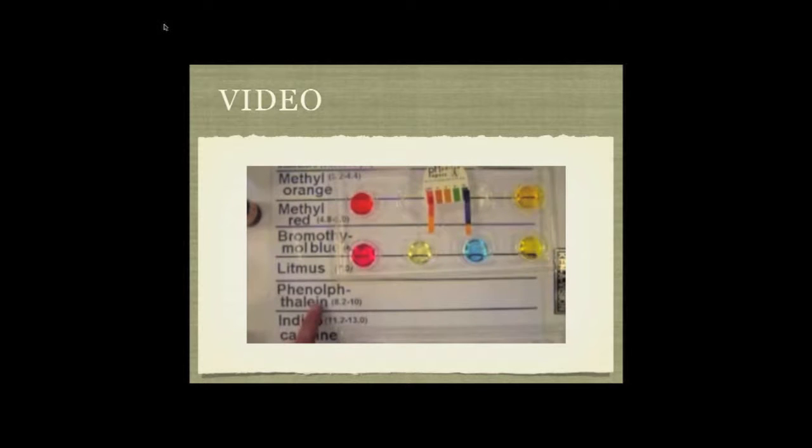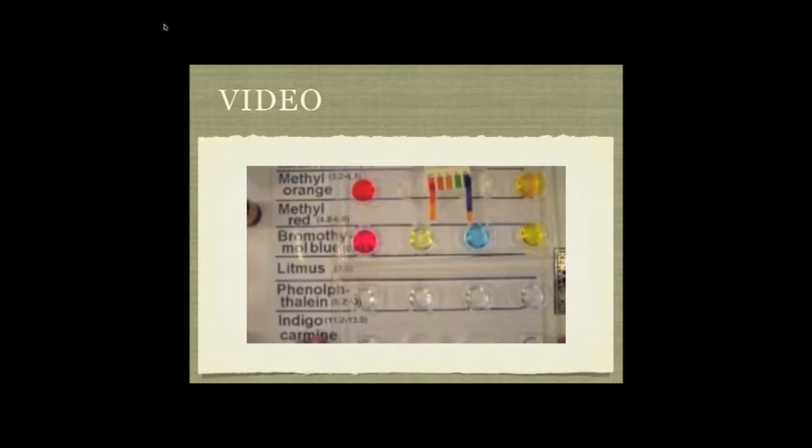We've got 2 more indicators. We've got phenolphthalein to try, and I'll show you that. Our phenolphthalein, it doesn't do much. It goes white, if anything, or clear. It'll clear up here, whereas phenolphthalein in our sodium hydroxide turns a pretty red, pink, okay, fuchsia.